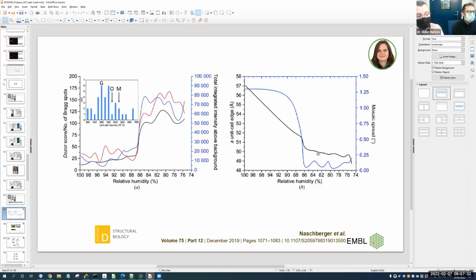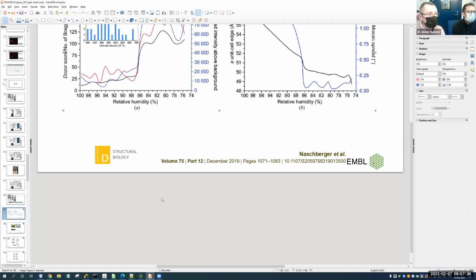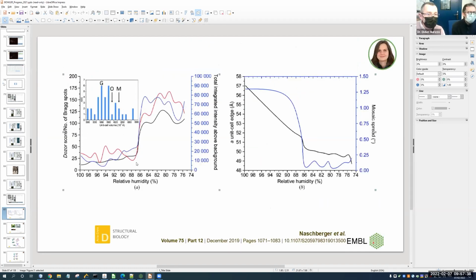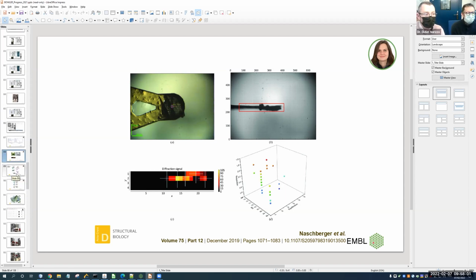And this actually made a huge difference to the project. And what was nice is that now that we've got MASSIF-1, we can combine these dehydration experiments with an automatically mounted crystal, with the sort of things that we've just been talking about, where we can then collect from multiple positions afterwards and do calculations to see what protocol gives us the best resolution, and then apply that to crystals and cryocool them and remount them. So we're pretty excited about the possibilities for full automation.